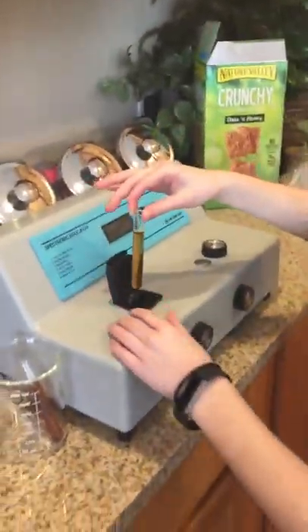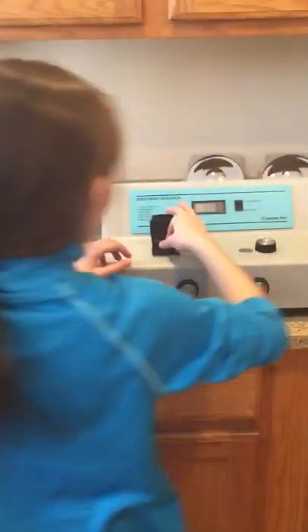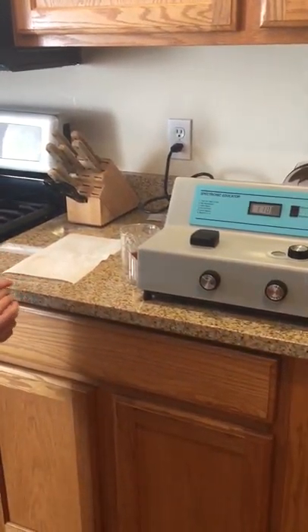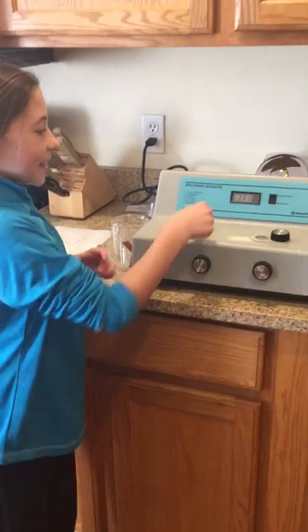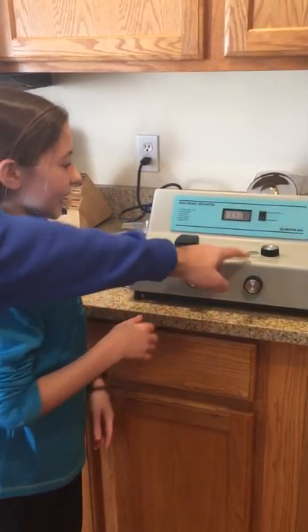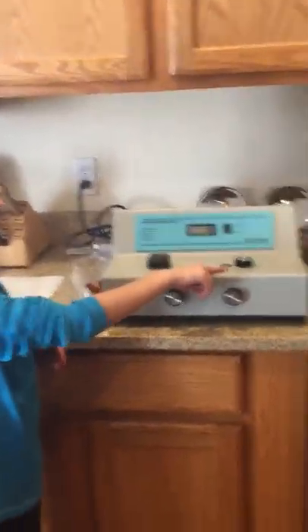And then you're going to bring it up from here. What are you putting it in? The spectrophotometer. And then you're going to see what it reads. So it keeps changing — it's just going to see how dark it is. So right now it's 1.11, and it's at 400 nanometers.